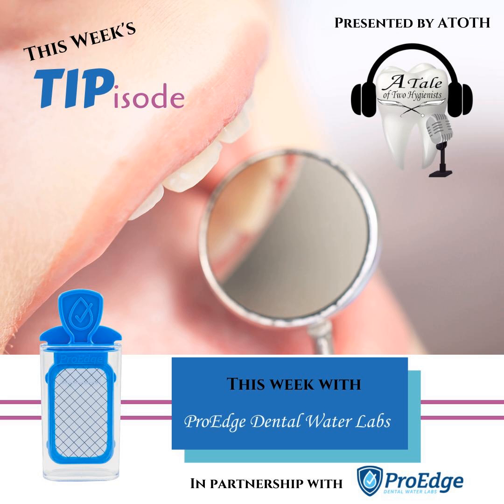Combined samples, commingled or pooled samples, are a great way to save money right off the top. And yes, the data shows that false positives or false negatives couldn't happen more than 3% of the time. But if the samples are of equal size, you can hang your hat and document that you did a combined sample from Op1 and passed. You can be confident that at least in that operatory, your water's safe.